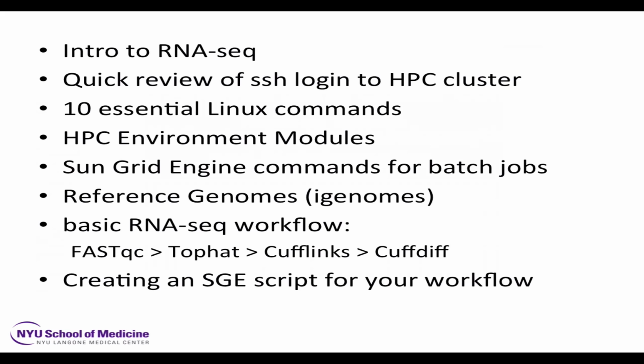I'm going to show you some SGE scripts, and then I want as much as possible for you to type them yourself, submit them into the queue, experience all the errors that you're going to get, and troubleshoot your scripts, because that's how you really have mastery of it and walk away from the workshop actually confident that you can do this for yourself, rather than just grab my script and rerun it and say, yes, I can type the command qsub. I want you to actually feel like you could draft one of these scripts and run this software for yourself.